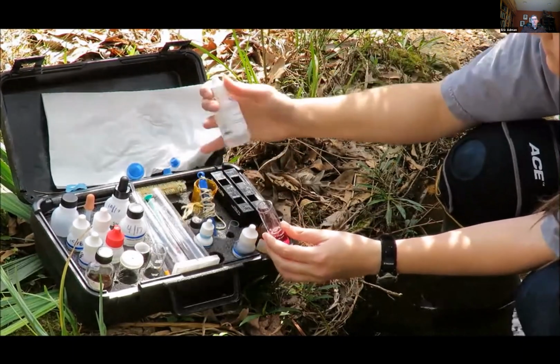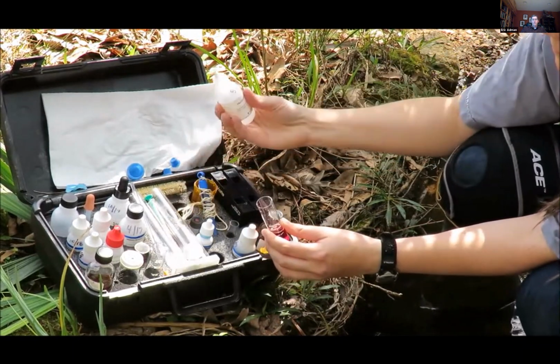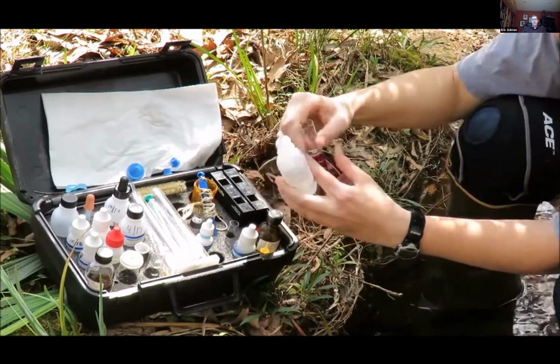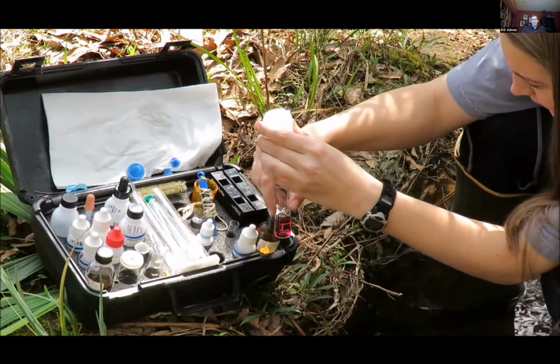Locate the hardness reagent number 7 bottle. Add 1 drop of reagent at a time, swirling to mix between each. Be sure to allow time between drops for color change to occur, especially during cold weather. You will need to know how many drops you add to your sample, so don't forget to count.